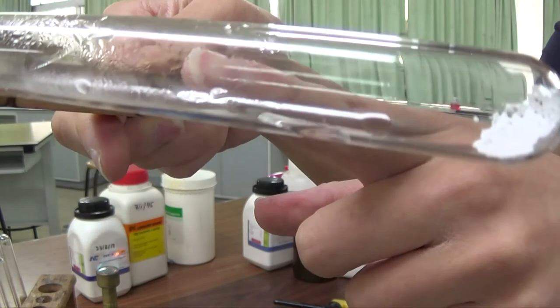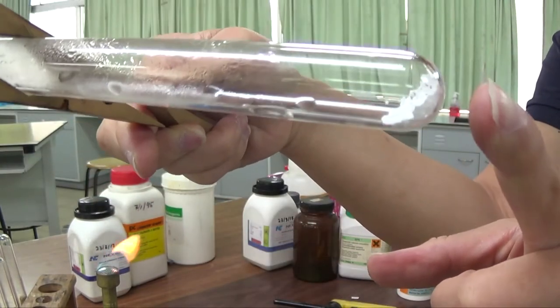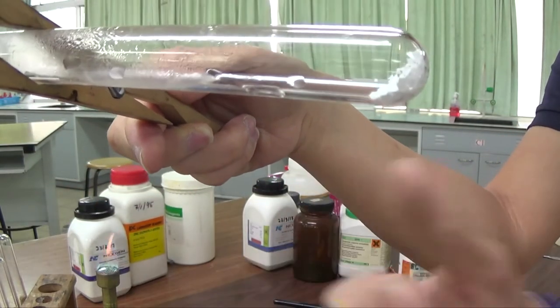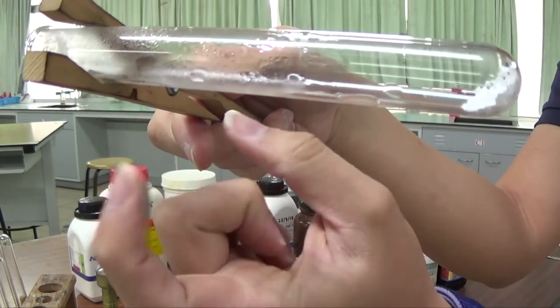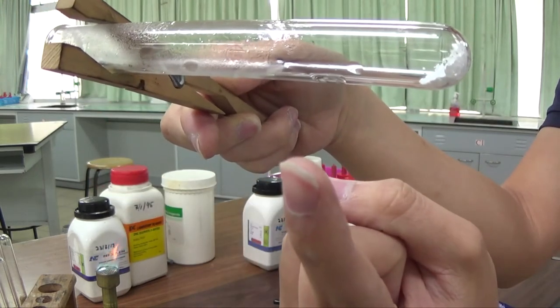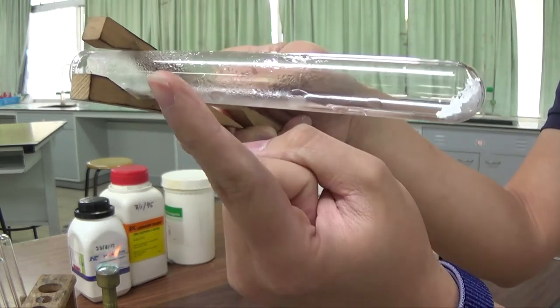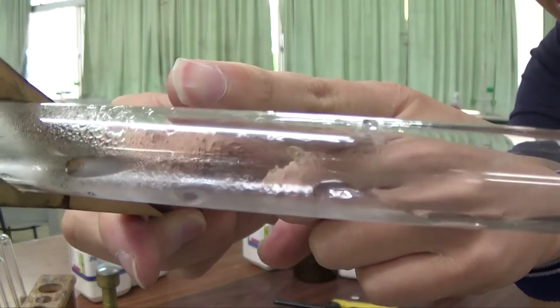There is actually colorless liquid formed on the upper side of the tube because you are removing the water of crystallization, and the water of crystallization escaped as water vapor because it's very hot. They escaped as H2O gas, but the upper part of the tube was cold. So when the hot H2O gas, the steam, moves up to the upper part of the tube, they will condense, because hot to cold, they will condense on the upper part of the tube. So your observation is you get colorless liquid.